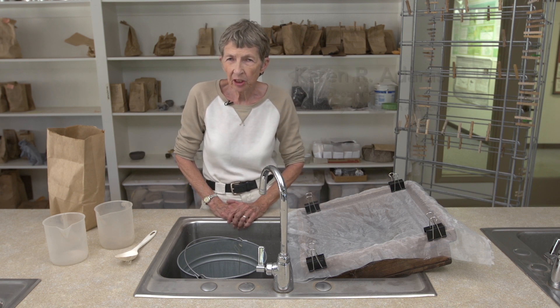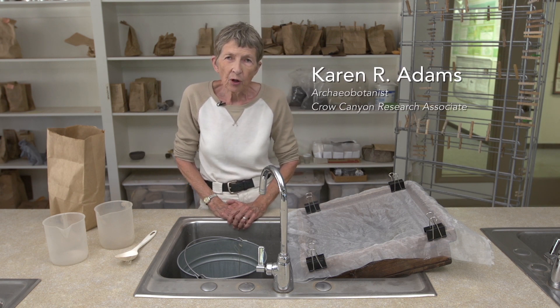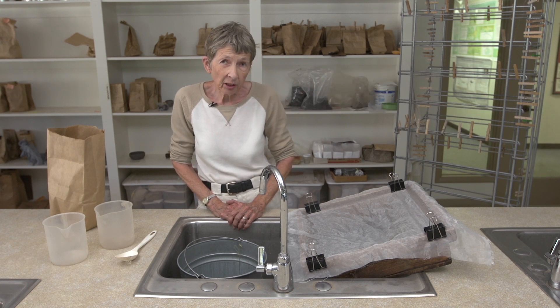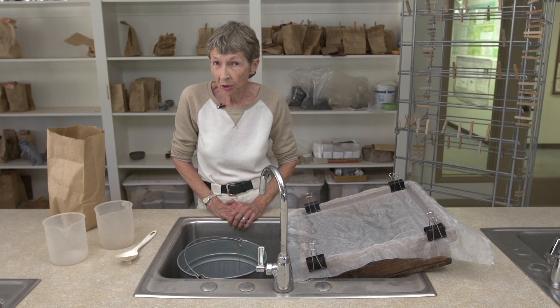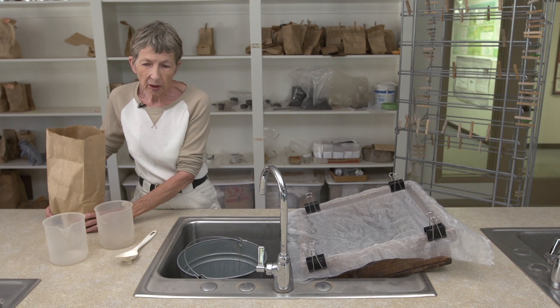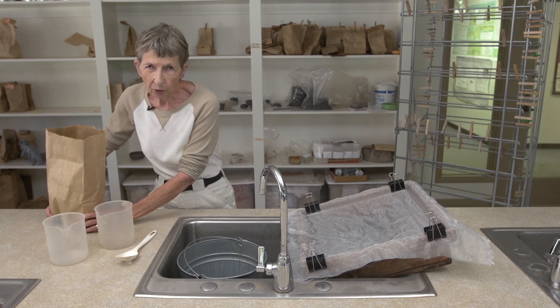I'm now going to process a flotation sample. This flotation sample is a dirt sample from one of the local sites. It dates to about AD 700, which is about 1300 years ago. The first thing I'm going to do is measure out a liter of the material that's in this bag so we can pour it in water and do the flotation.